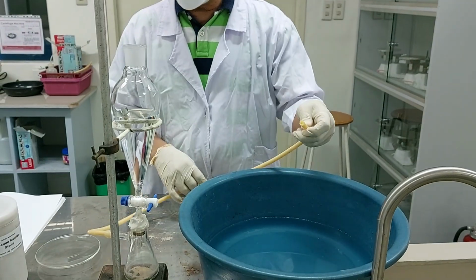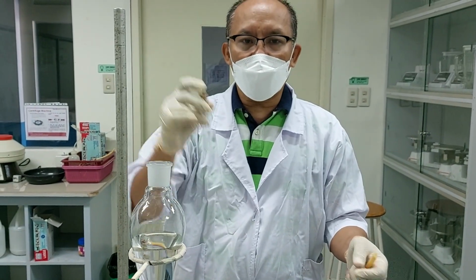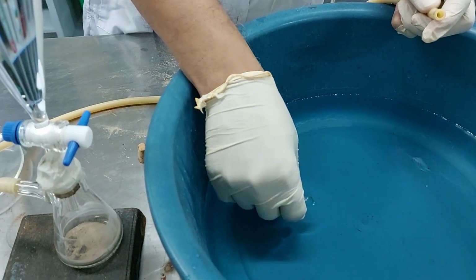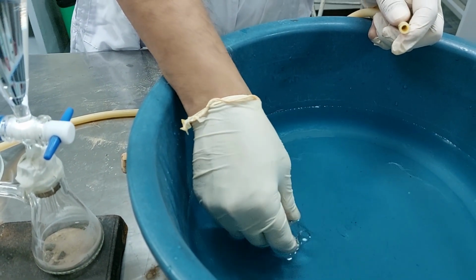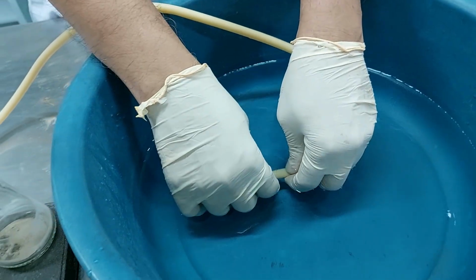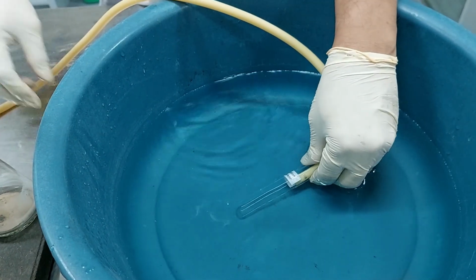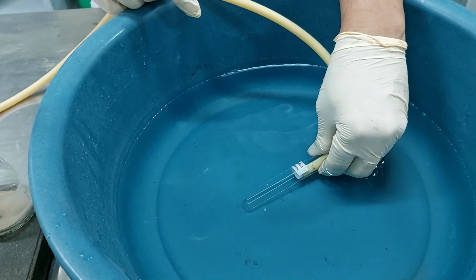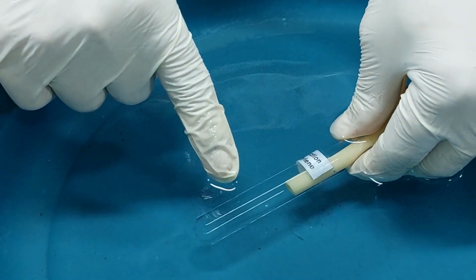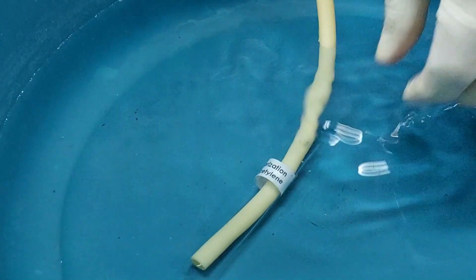So you have the collecting test tube. We have to fill this up with water because we're going to do the water displacement. So fill this up completely with water, and the rubber tubing should be underwater, like that. So it is now ready. Once the gas is produced, this will displace the water inside the test tube, and then we have to cover this immediately with the cork. So let's see if we can do this.